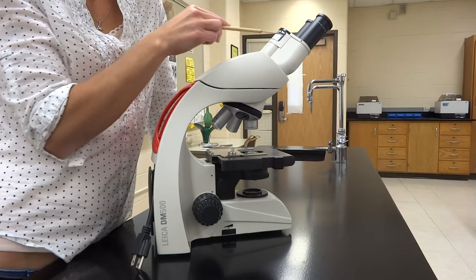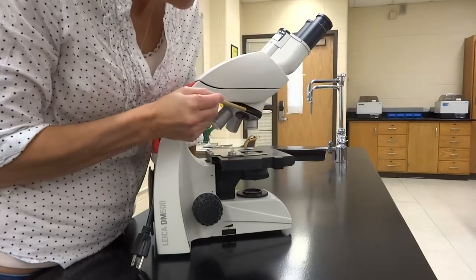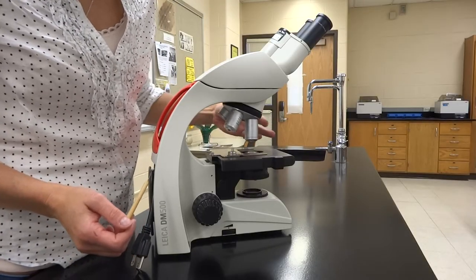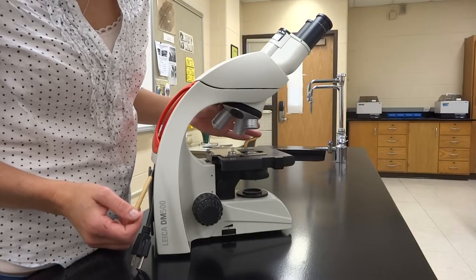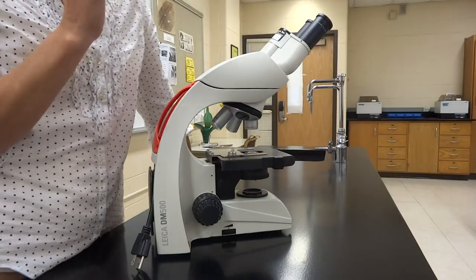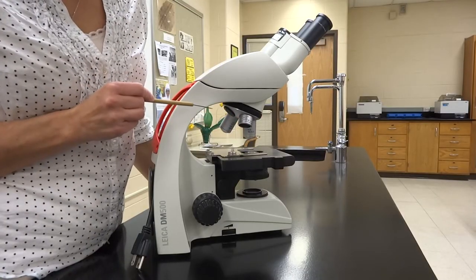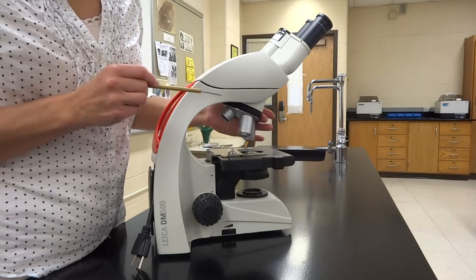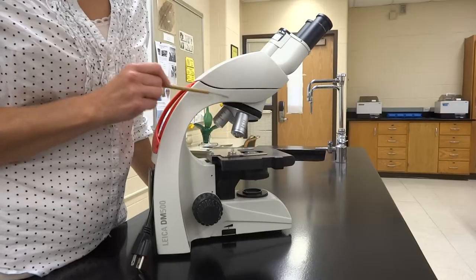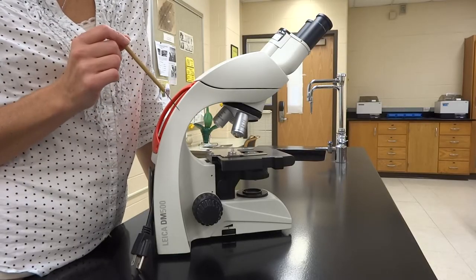The next thing we're going to talk about is the nosepiece. Our nosepiece is rotating and has three different objectives on it. In more advanced classes you may have a fourth, which is an oil immersion lens. We have three: the 4x, which is the smallest and gives us scanning magnification; the 10x, which is the longer yellow one; and the high power 40x, which has a little blue stripe. These add extra magnification to whatever we're looking at on the stage.